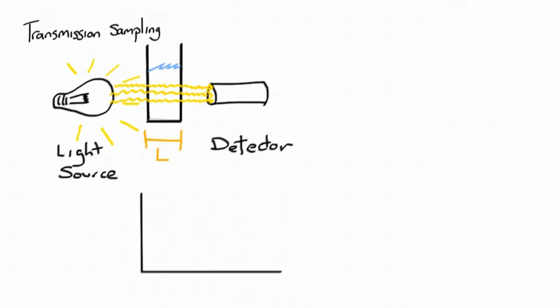If we examine the relationship between the length of the path traveled and the number of photons traveling that distance, we create a path length histogram. This histogram shows that all photons have traveled the same path length, defined by the optical cuvettes. In order to obtain an accurate calculation of the concentration of a sample, Beer's law assumes that all photons from the light source travel the same distance, taking the shortest path directly through the sample. In this example, Beer's law's assumptions are satisfied, since all photons travel the same path length.